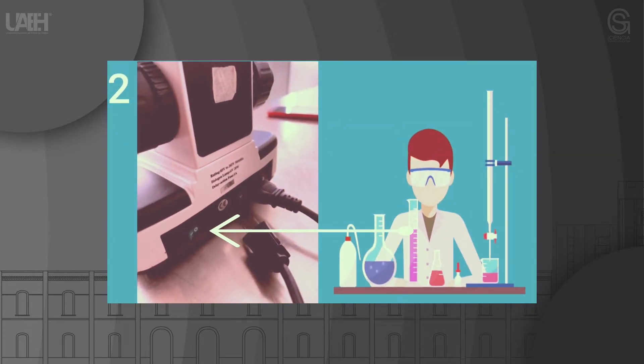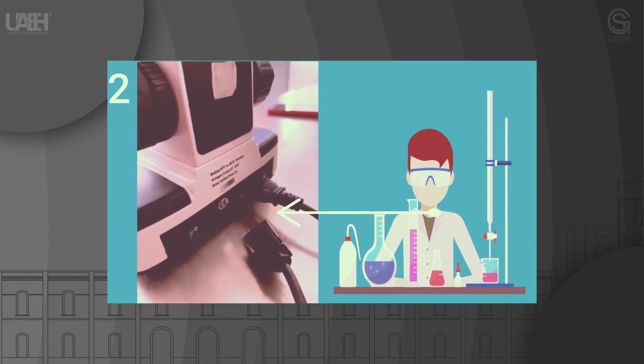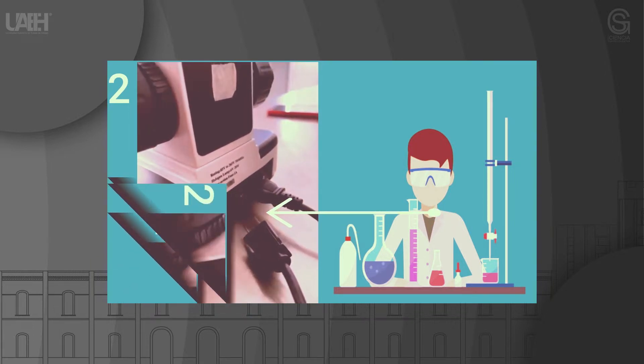Step 2: Turn on the microscope light. This may require plugging into the power first or making sure the batteries are charged.